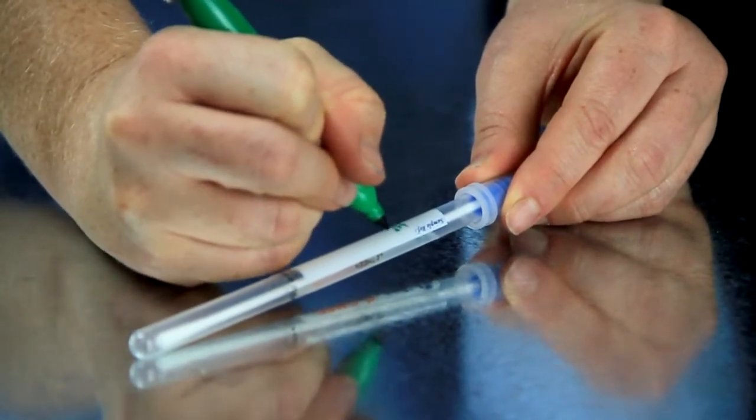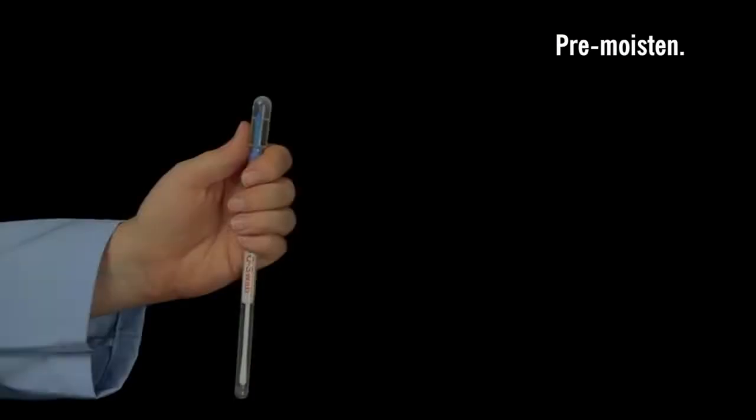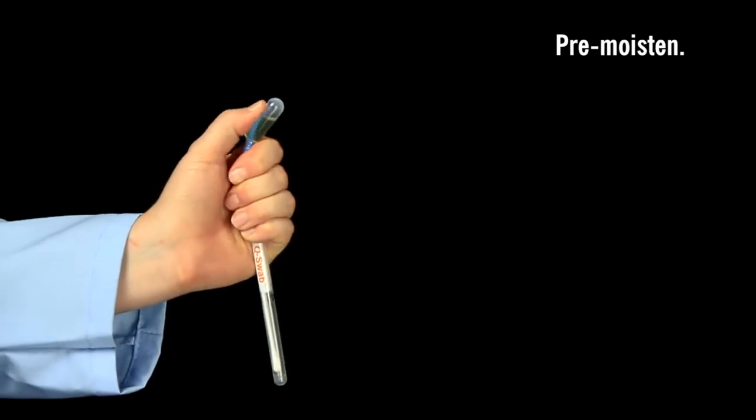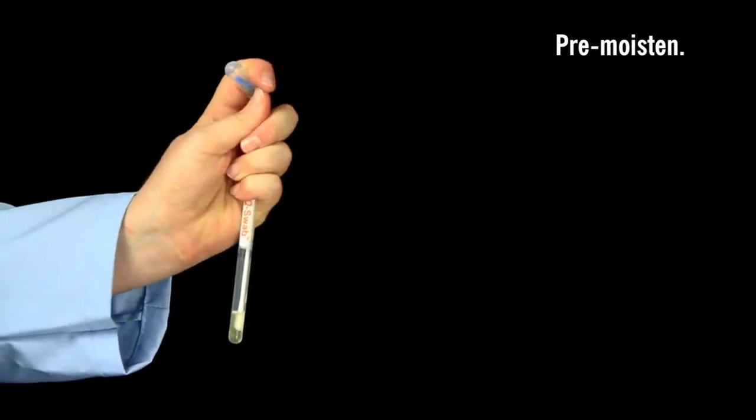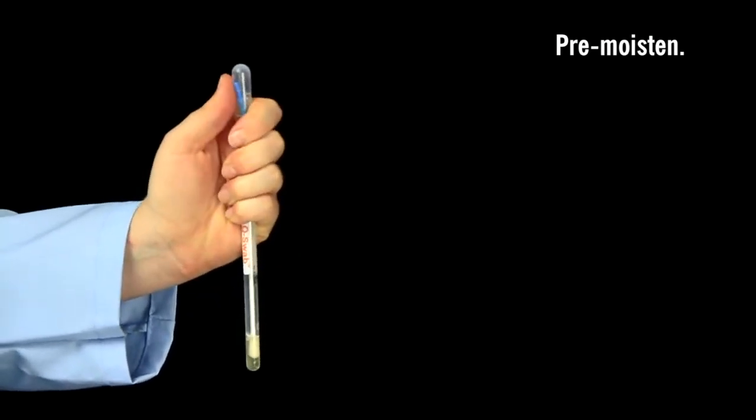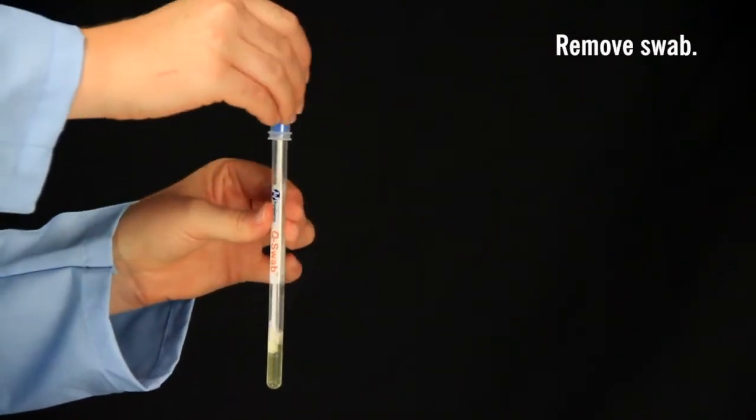Write the test location on the label for easy identification. If the swab needs to be pre-moistened, break the snap valve to wet the swab tip before sampling. Remove the swab from the tube.